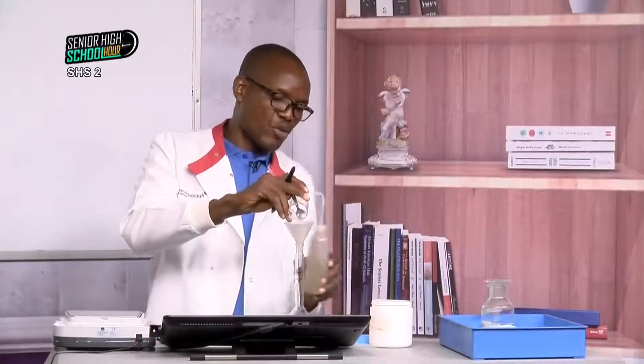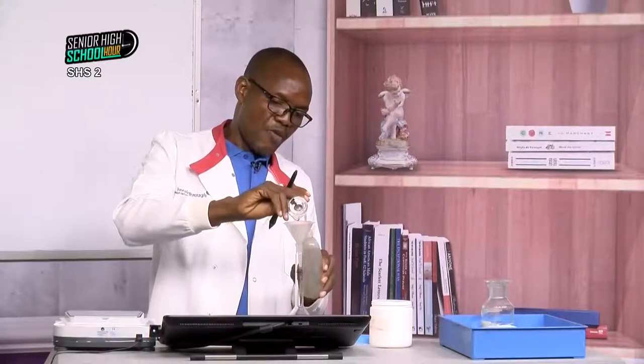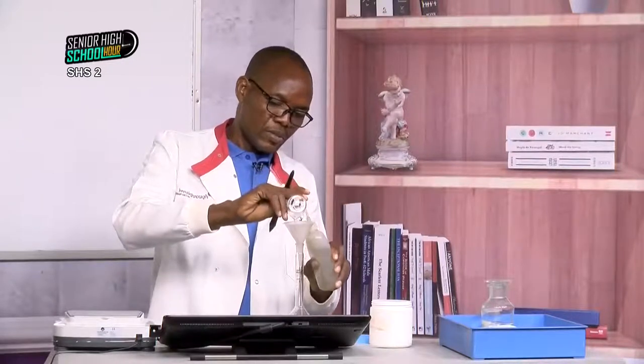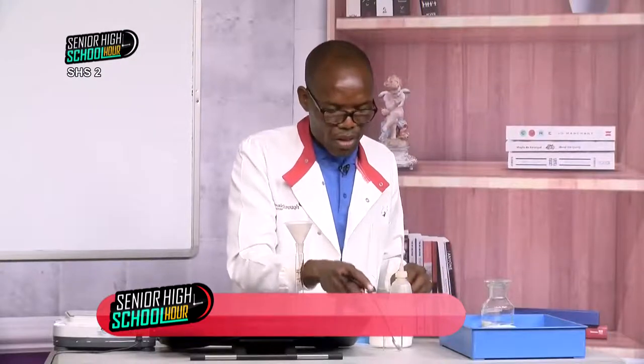So transfer. Next thing, I have to rinse what I have used to stir, whether it's the spatula or you are using a stirring rod. So rinse everything, please lose nothing, and add all the rinsings to the content in the volumetric flask. Okay, so the next thing is to swirl the flask. Don't shake, just swirl, so that if there is any other particle in there, everything must dissolve. Is that okay? Yes. Okay, so I think that's it.